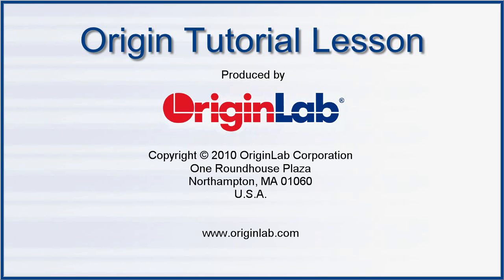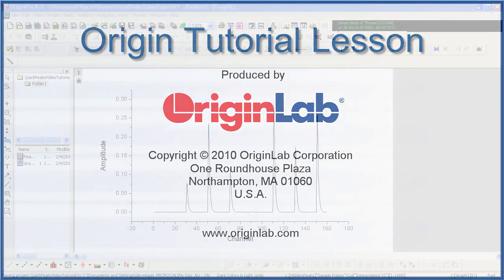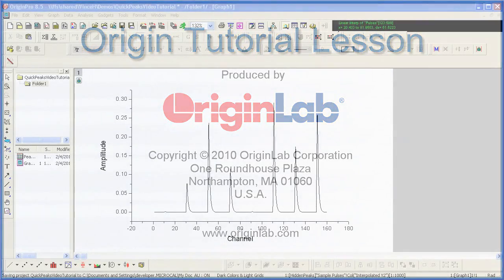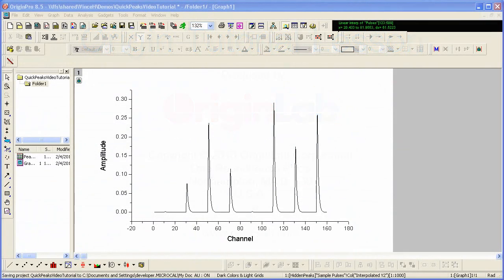The Quick Peaks gadget is a tool for rapid examination of peak and baseline data. I will demonstrate the use of this gadget by analyzing the following data set.